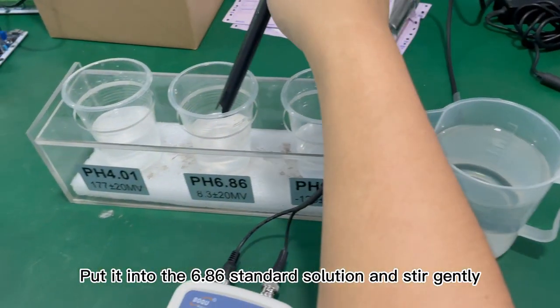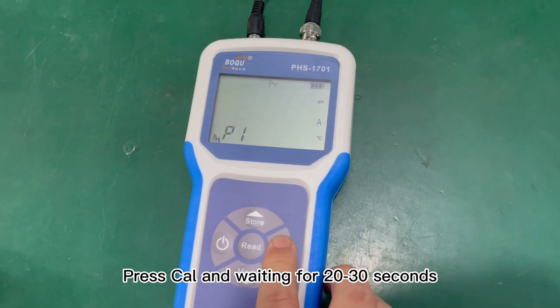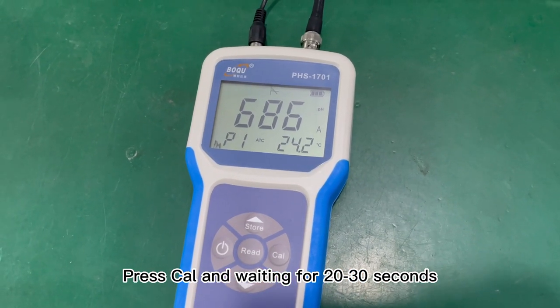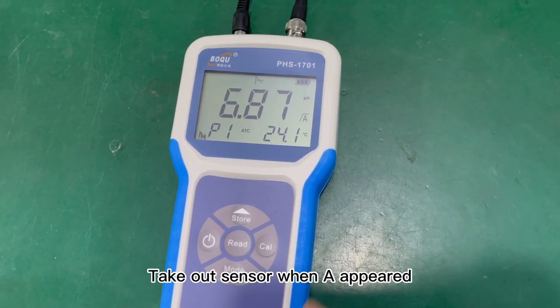Put the electrodes into the 6.86 standard solution and stir gently. Press Cal and wait 20 to 30 seconds until the value appears on the display. Take out the sensor when it appears.